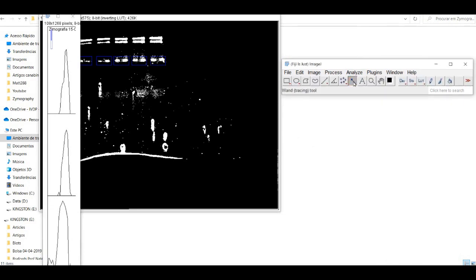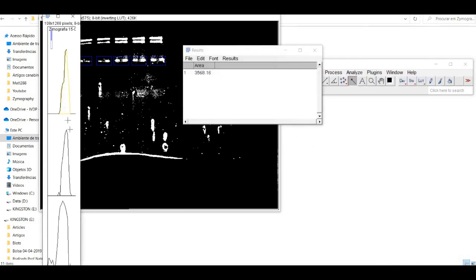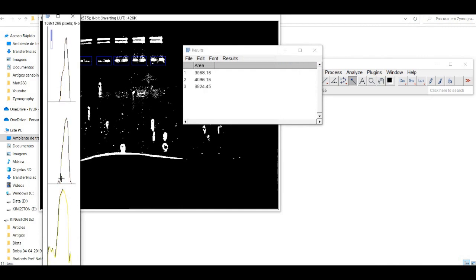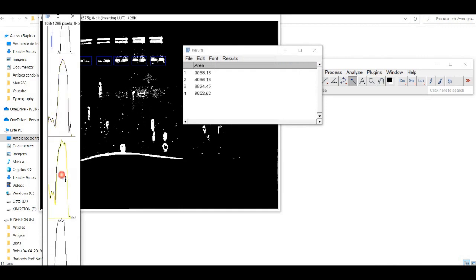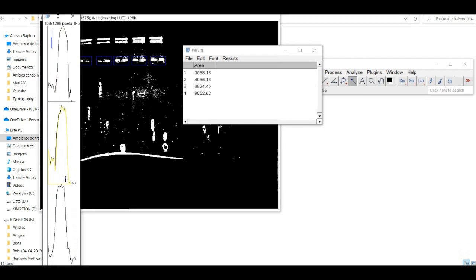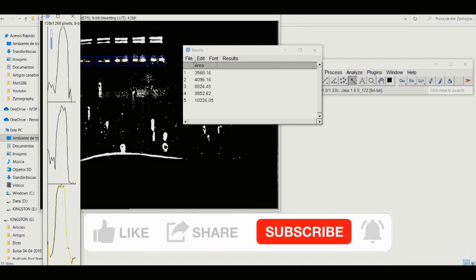Finally, you'll want to save the results of your analysis so you can use them later. Simply click on File and then Save As. Select a location to save your results and give the file a name, then click Save.